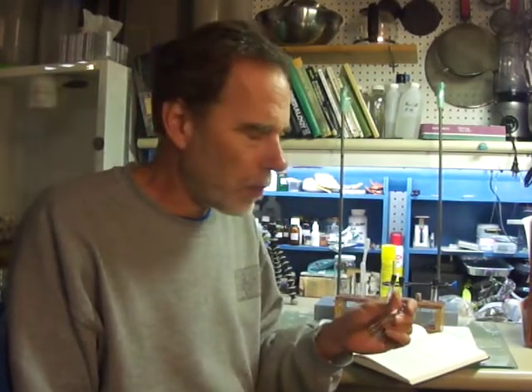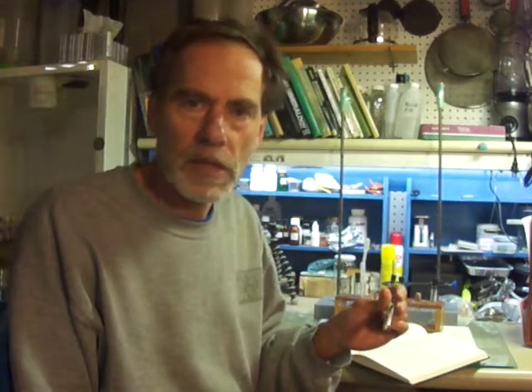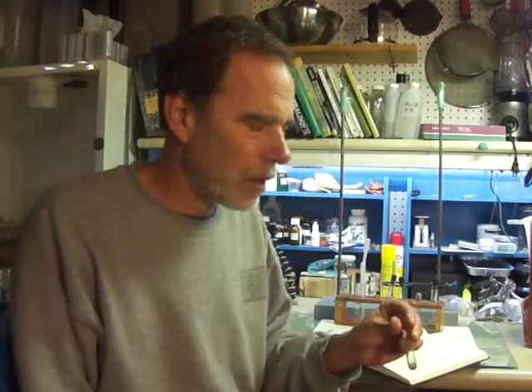Once again, there's a whole bunch of steps. Basically, you acidify it and then take the pH up, making it basic once again, and putting in an oxidizer. But we'll go through the bunch of steps, and for some reason they have you transferring it from a test tube to a casserole, to a test tube to a casserole, to a test tube, yada yada yada, for no apparent reason, because you're not really boiling anything off. So I'm going to just do it in a test tube.